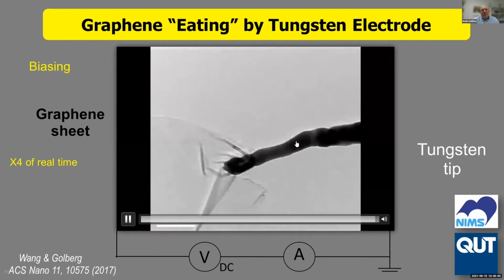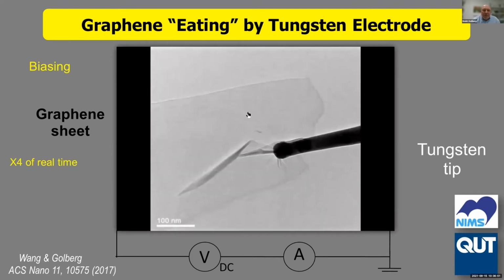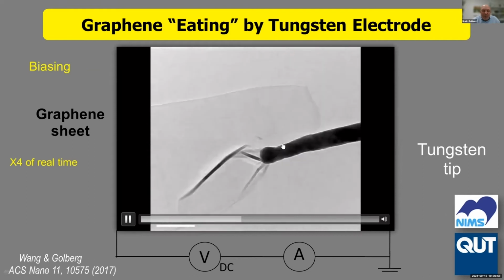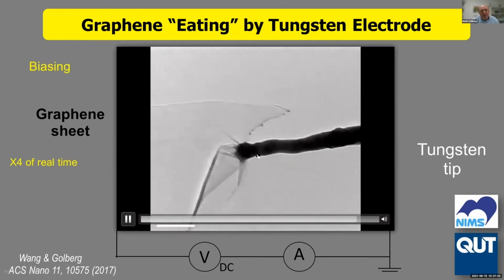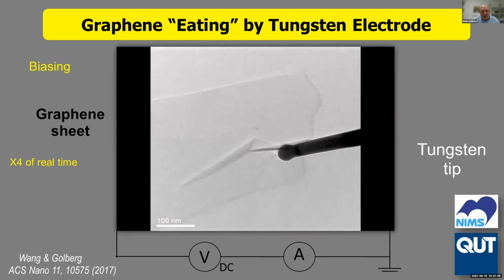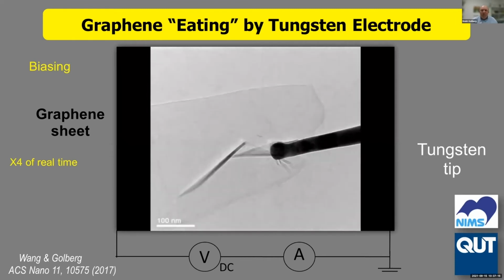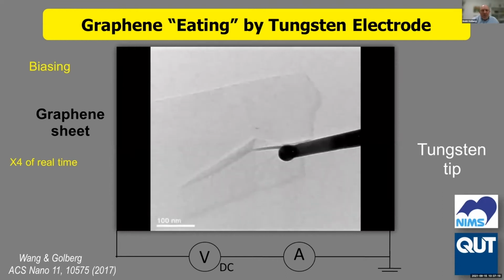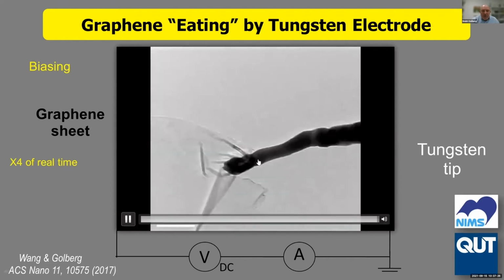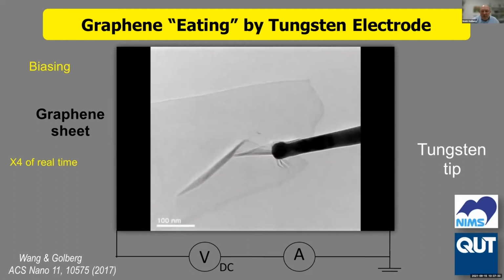So actually here we modulate the growth of carbon nanomaterial. We have carbon feedstock, we have catalytic metal here, and we have very high temperature, because temperature here could be up to 2000 centigrade. We have very high temperature inside the microscope due to Joule heating. So this is very interesting, and the specific conclusion here is that tungsten and every transition metal which forms carbides is not good for carbon electronics, because of a lot of interdiffusion processes, and one should be very careful because everything will be changing under current flow inside the device.